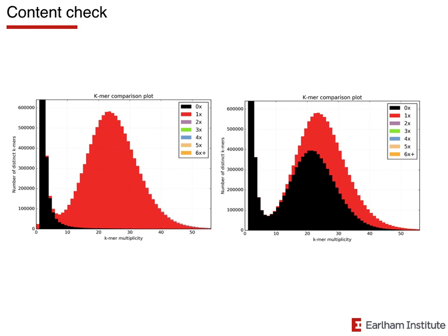But if you have an incorrect spectra copy number, then your assembly cannot be correct. Basically, you don't have the right content in there, or you don't have it the right number of times. Anyway, do remember that most assemblies are incorrect. It's just a matter of knowing how, and if they are still useful for your research purpose.